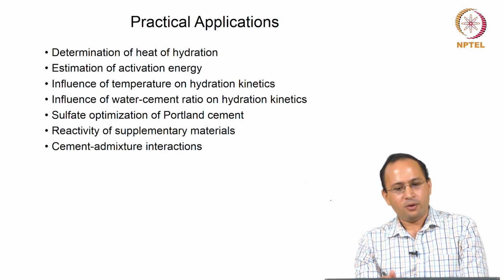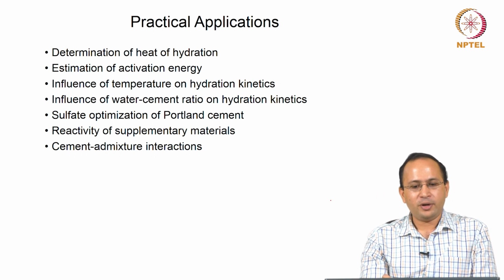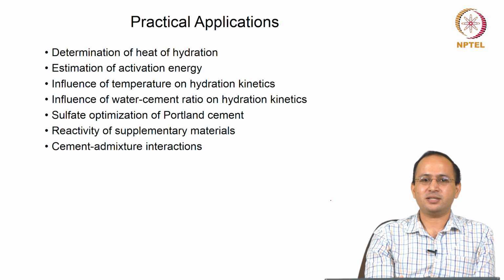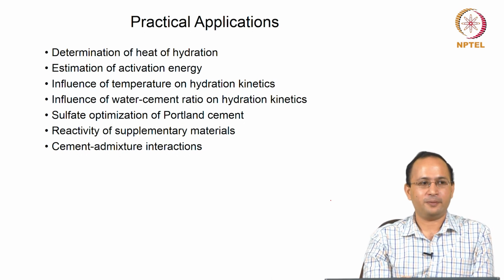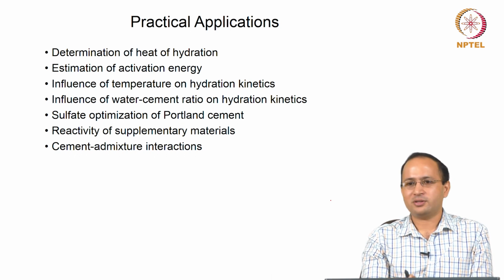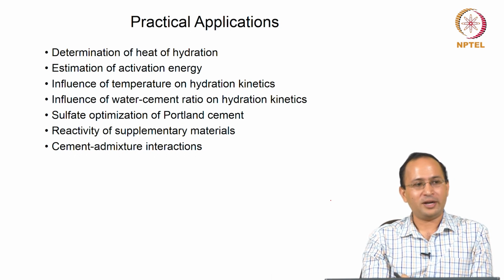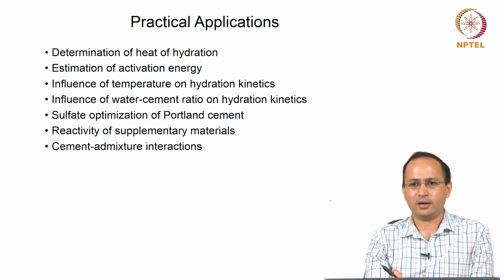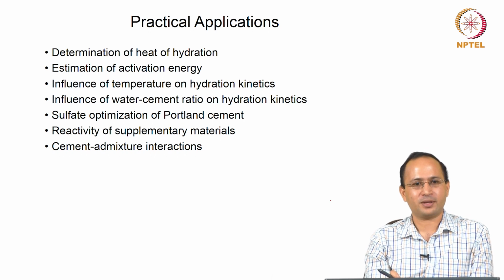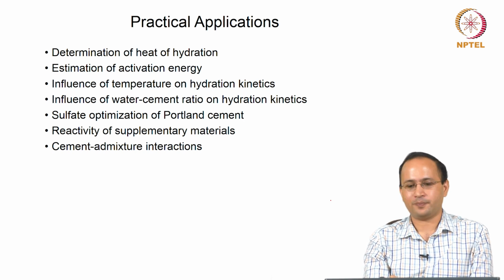Okay. Now we will look into some applications. It is very important to now look into the applications of calorimetry. The focus will be more on isothermal calorimetry because that is used quite a bit. I will also draw some applications from adiabatic calorimetry so that you can see the similarity. But most of the time we will talk about isothermal calorimetry because it is the most commonly used technique these days.